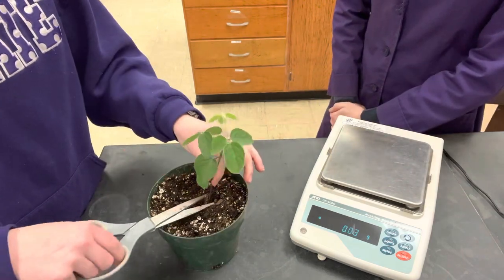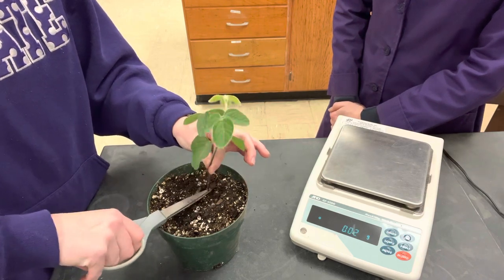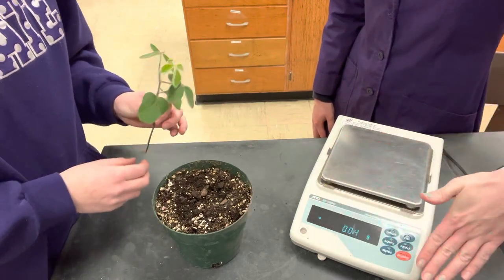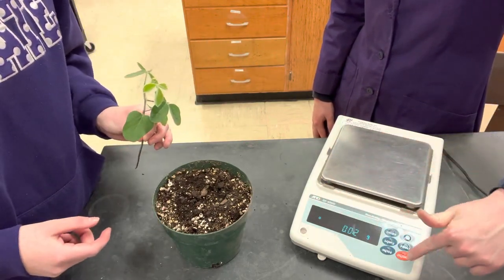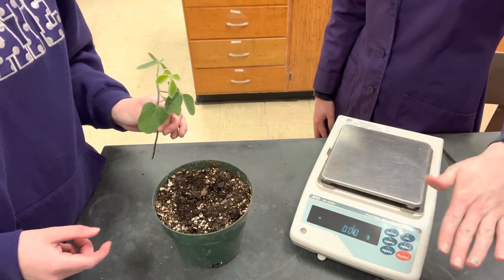So we're just going to cut right at the base and weigh it. You're going to want to make sure that your scale is zeroed out — right now it says 0.02, and we're going to want to go ahead and tare it to get it to zero.